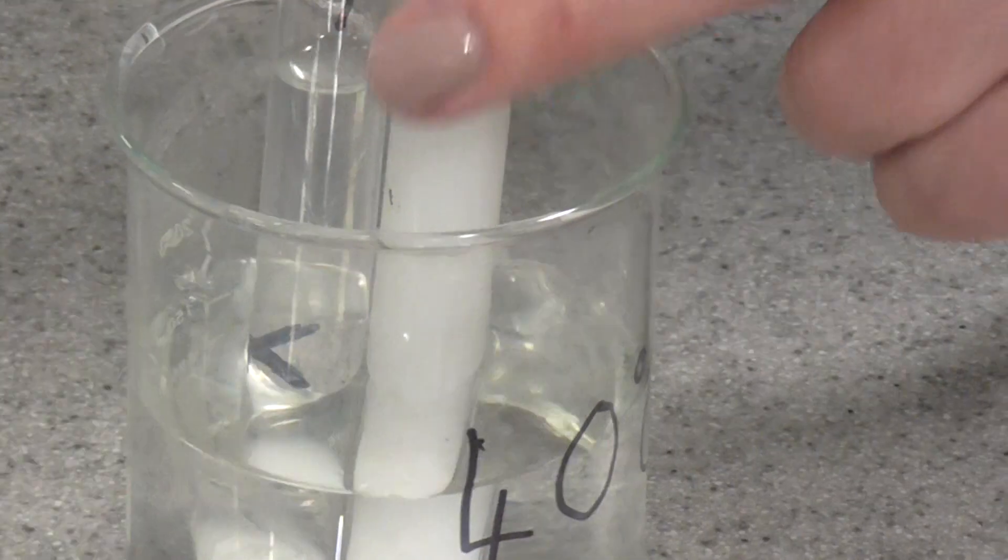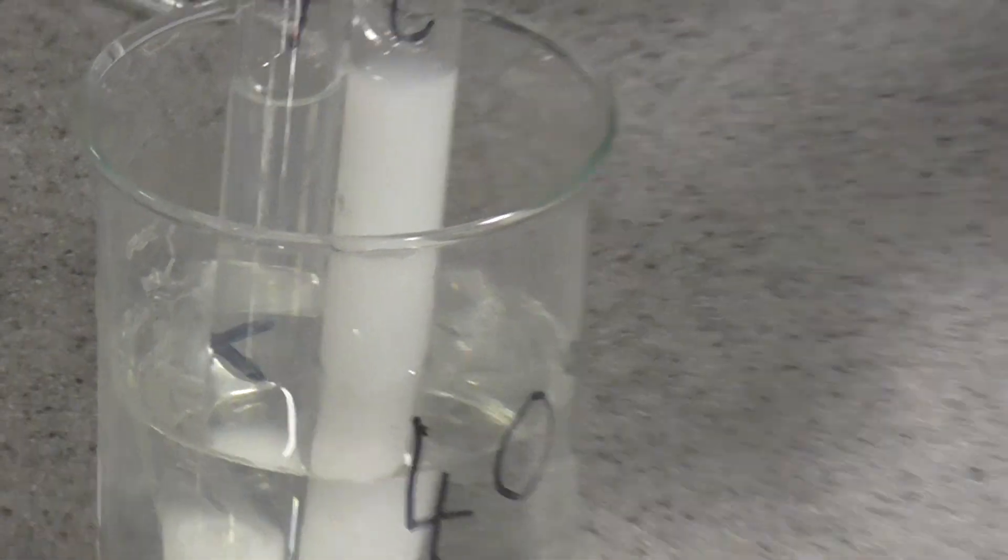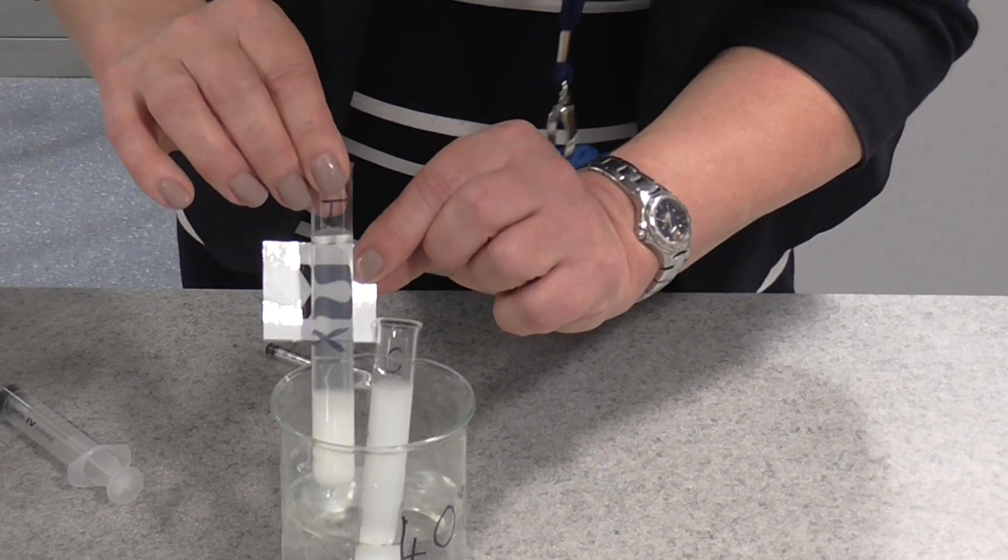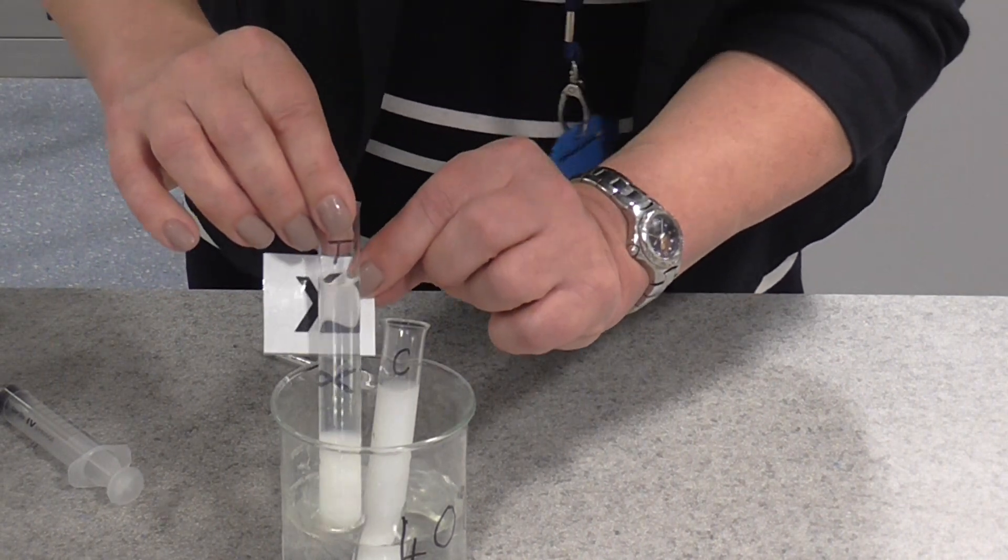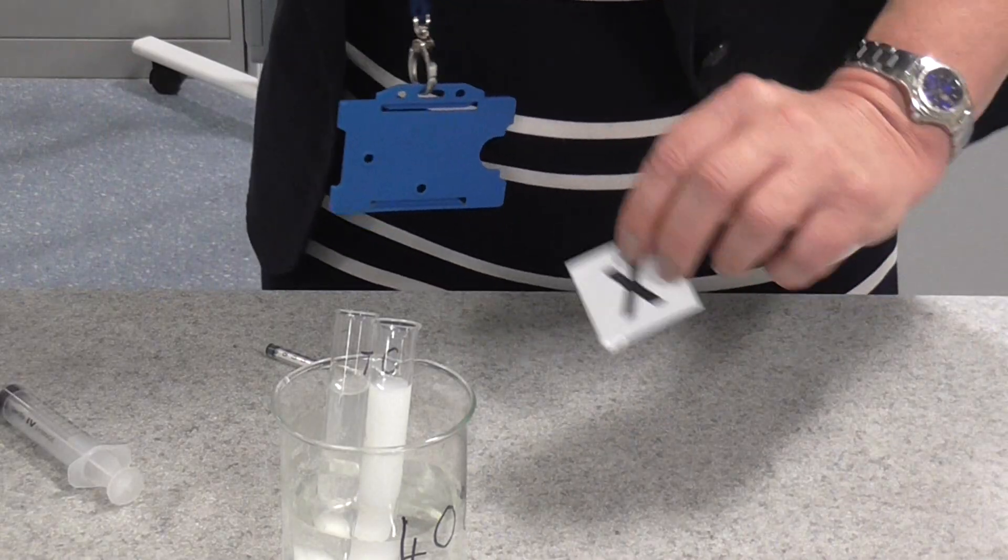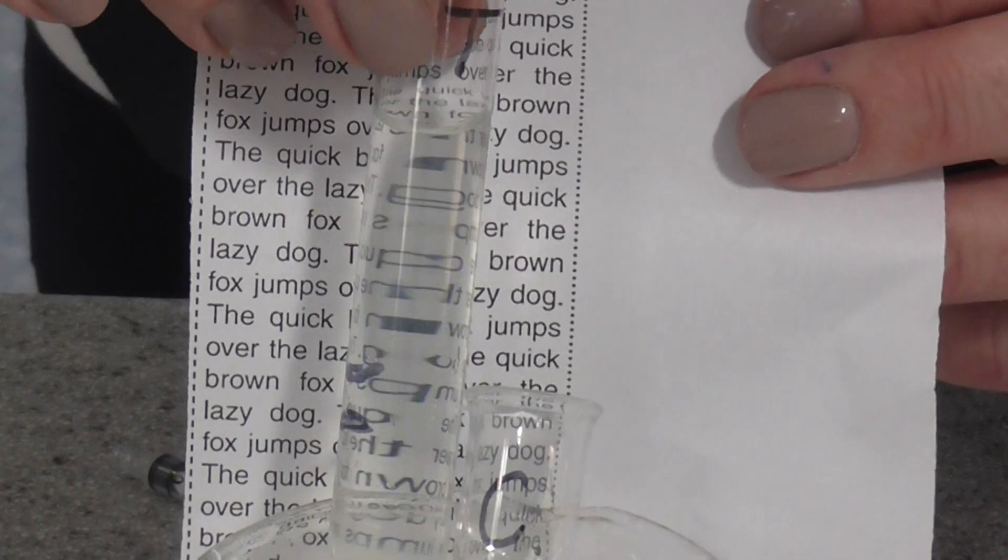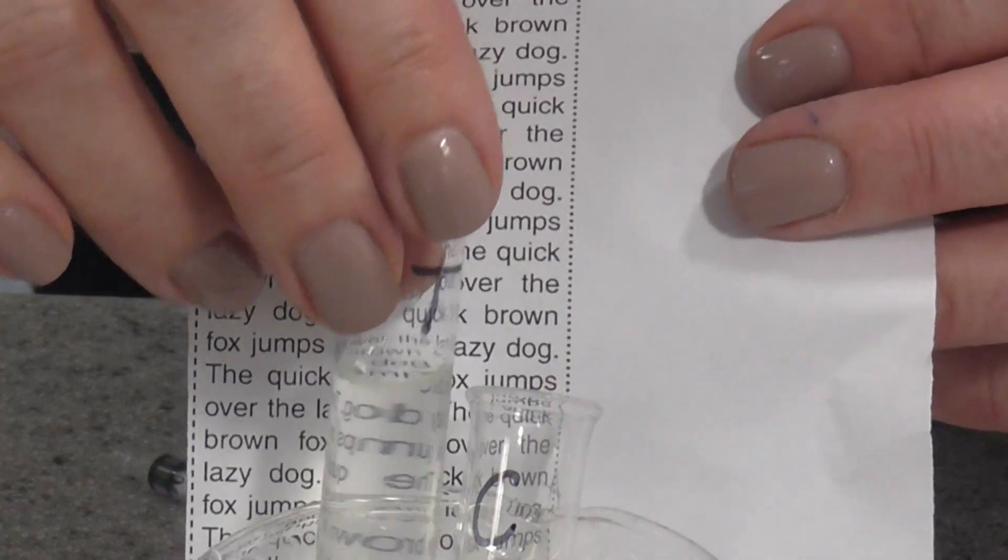There are other ways of doing this. You can actually have a printed X and clamp the tube in front of it, and time how long until it becomes visible. Or you can clamp your tube in front of some printed writing and time how long until you can actually read the text. That is the end point of this reaction.